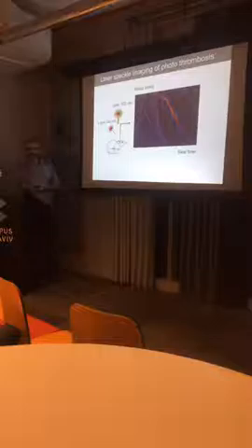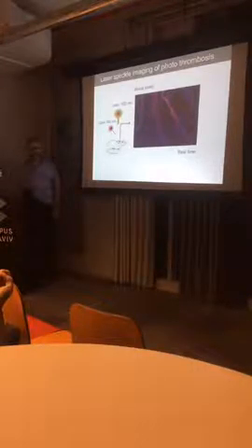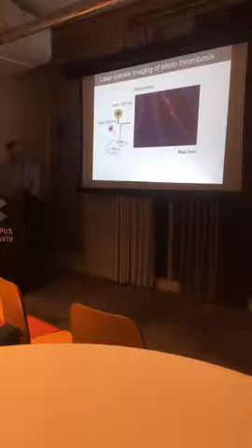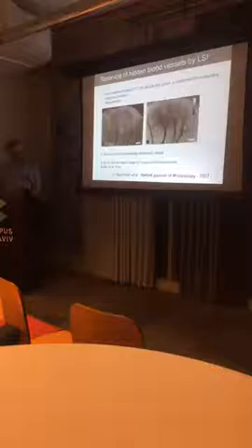The last slide. You are using a black and white camera, if I understand correctly. Yes. This you get by combining different pictures. This color image is a pseudo color image based on the intensity. Usually the laser contrast shows dark areas where the blood flow is much more intensive, but here we make the opposite, where the intensity corresponds with the brighter point.